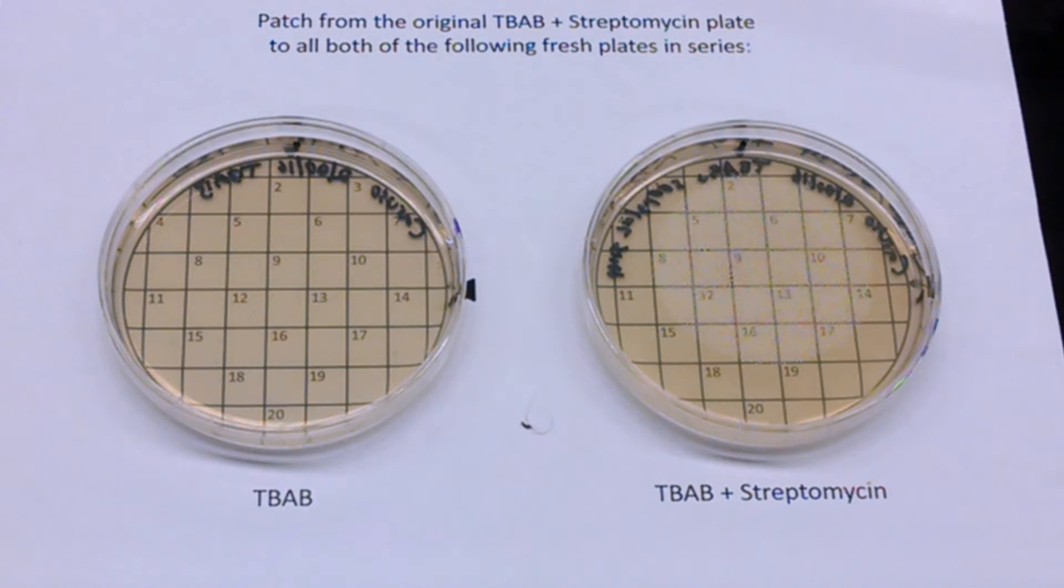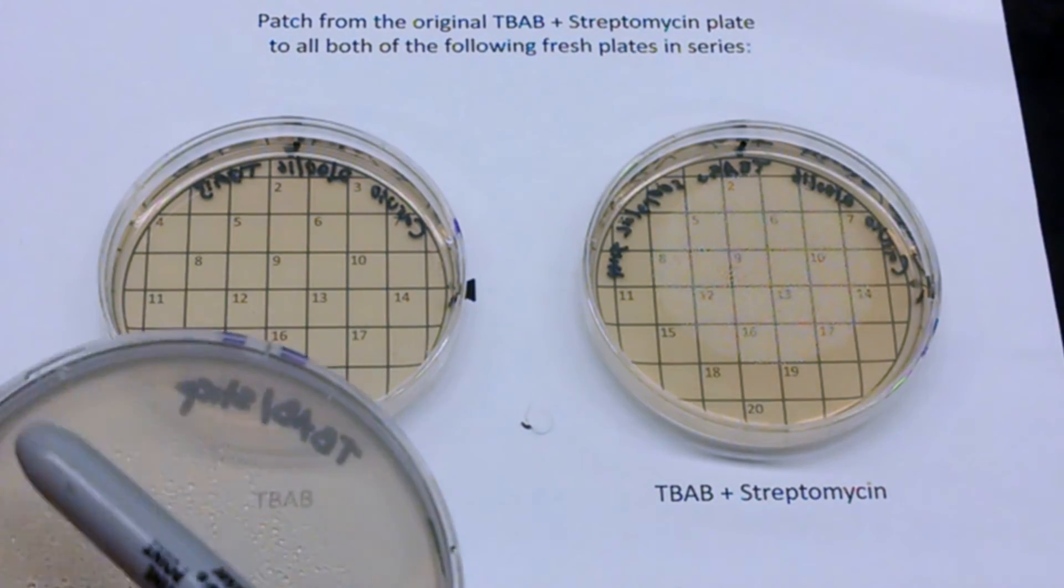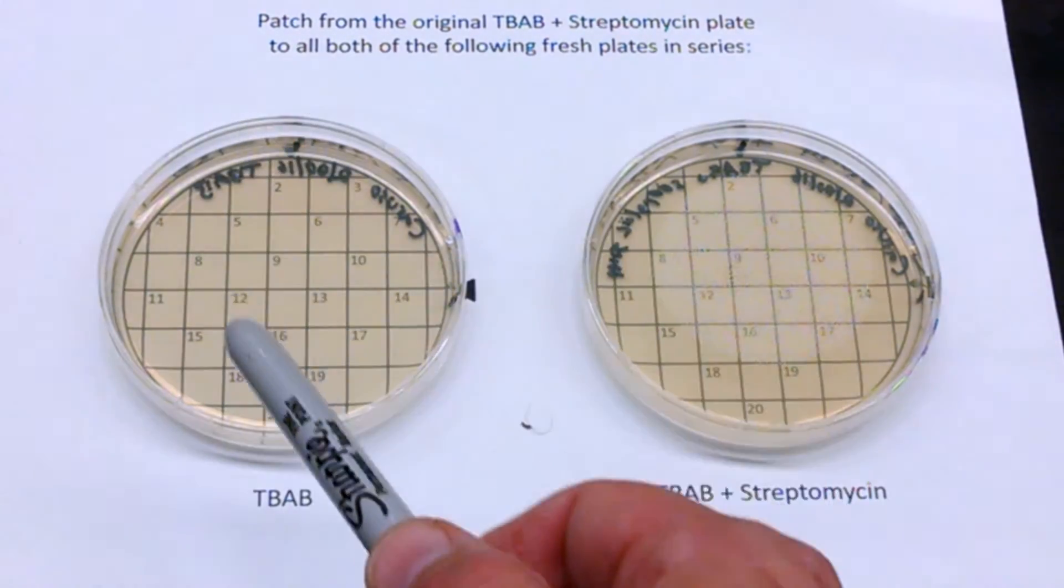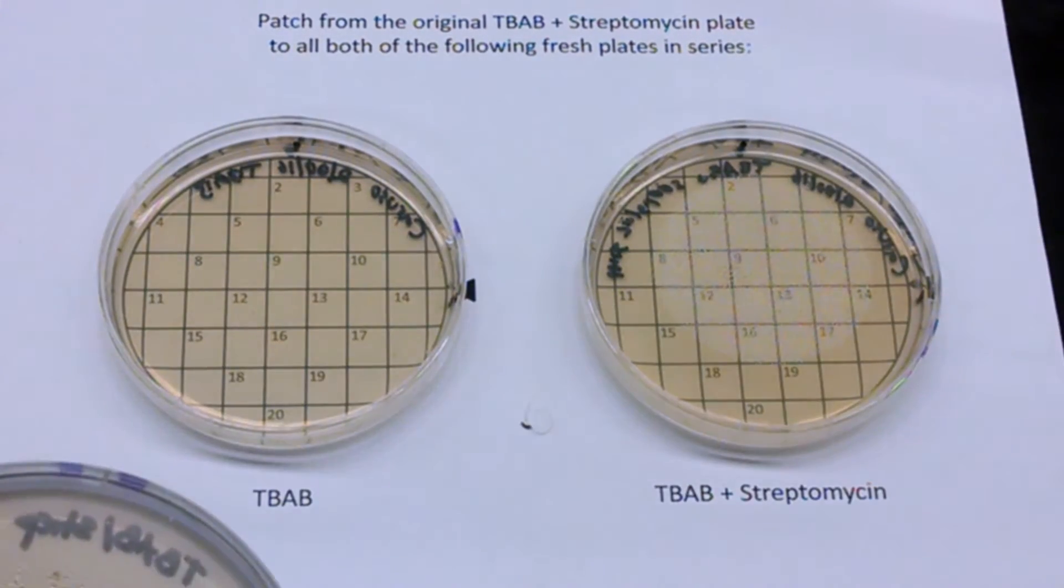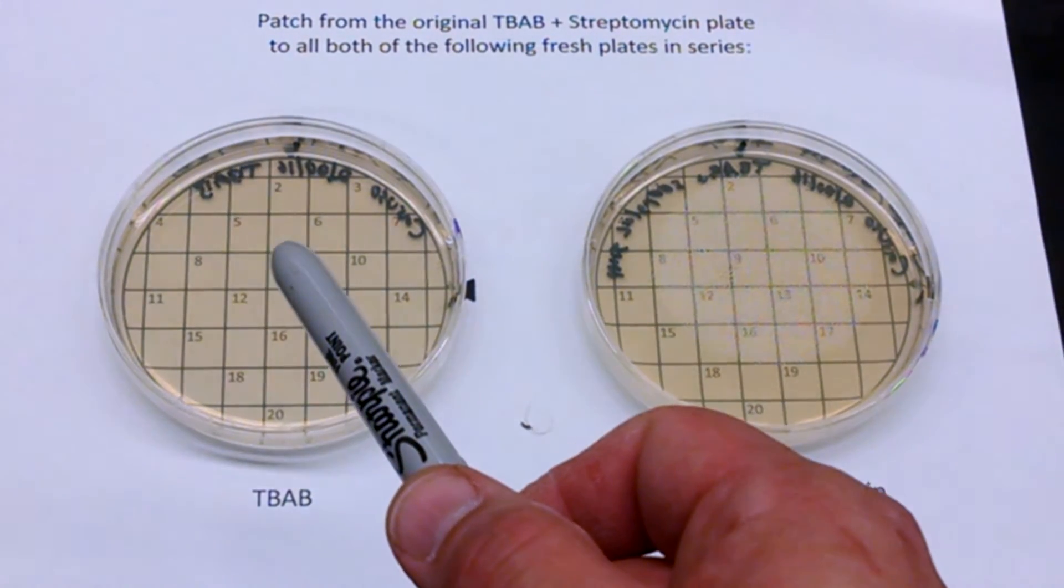And so each one of these squares is a place for you to take your toothpick, touch a colony. And so if you don't have 20, you're not going to be able to do 20. You don't have to do one of them 20 times. But you're going to touch a colony and you're going to draw a line. Don't just put a dot because you want to see how well it grows. You're going to draw a line filling one of these squares.